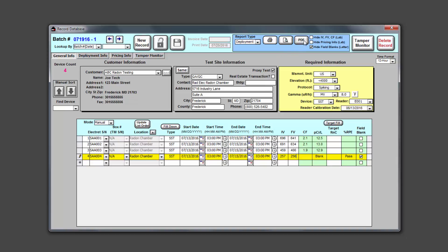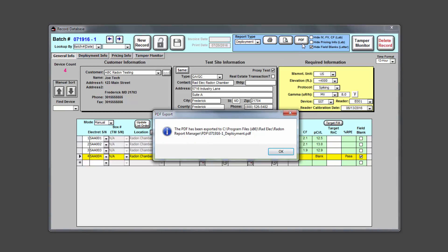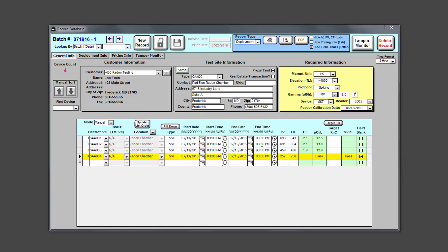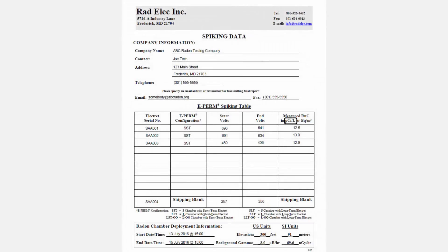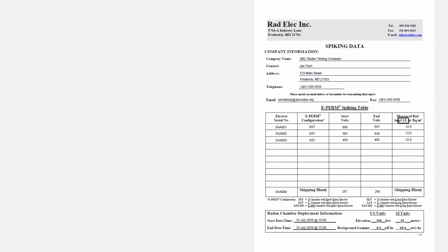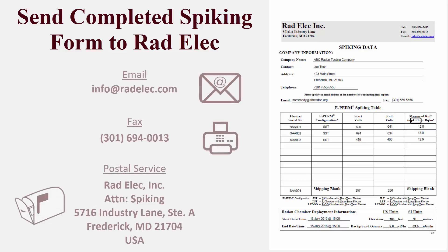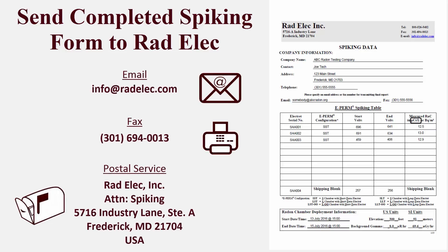After we've finished entering in all of our final voltages, let's create a PDF of the spiking service form. Make sure that the report type is set to deployment, and then click on the PDF button. Alternatively, you can print out a new spiking service form if you intend to fax or mail your results to Radelec. After saving our record, let's exit out of the program. Our completed spiking service form should look something like this. Our next step is to send this form back to Radelec so that the office can compare our results with the known radon concentration of the chamber. You can email, fax, or snail mail the completed spiking service form — though for quickest results, I'd recommend one of the first two options.